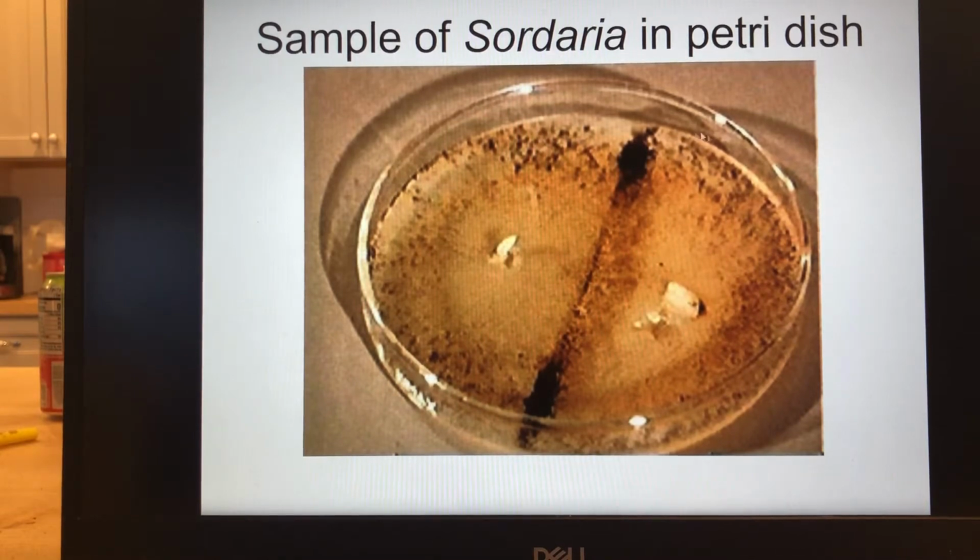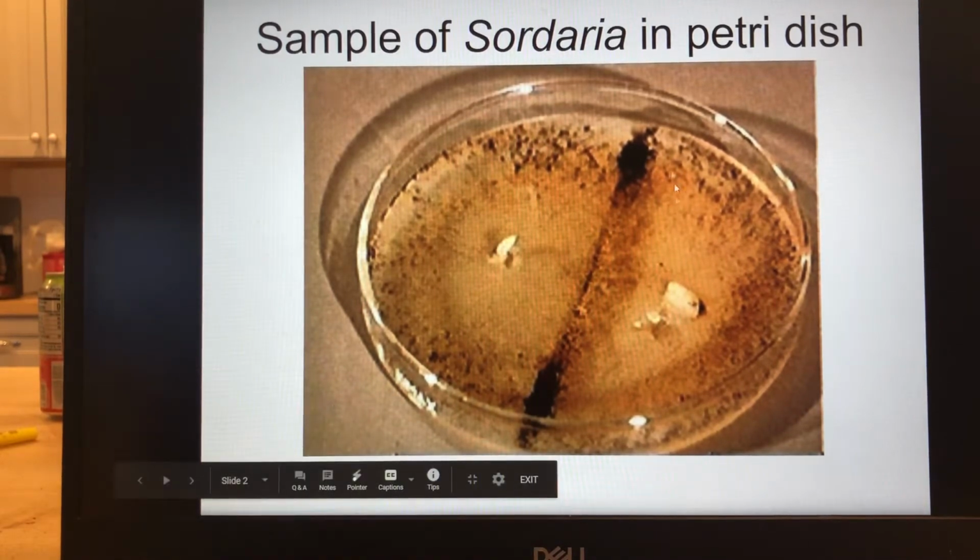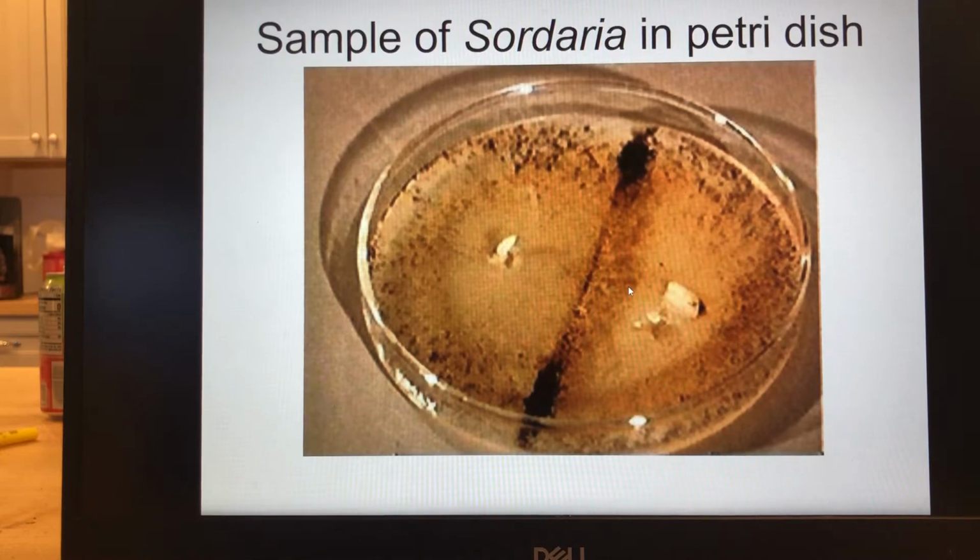Now we're not going to be able to put them in a petri dish, so I have some cards that will also be posted with the lab that you're going to have to look at and be able to see the extent of crossover. This is a really cool lab in that we are able to directly see examples of crossing over.